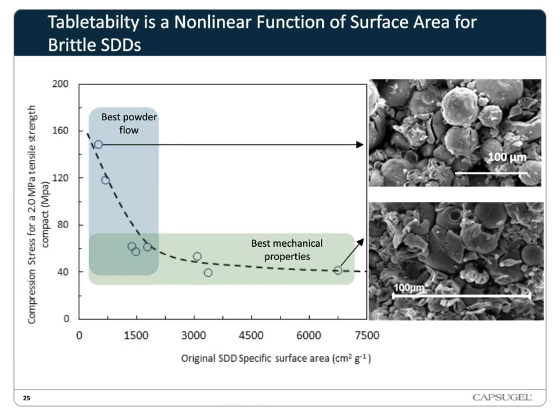Tabletability is a nonlinear function of surface area for brittle SDDs. So what we did here was we plotted the SDD-specific surface area against compression stress for a 2 megapascal tensile strength compact.